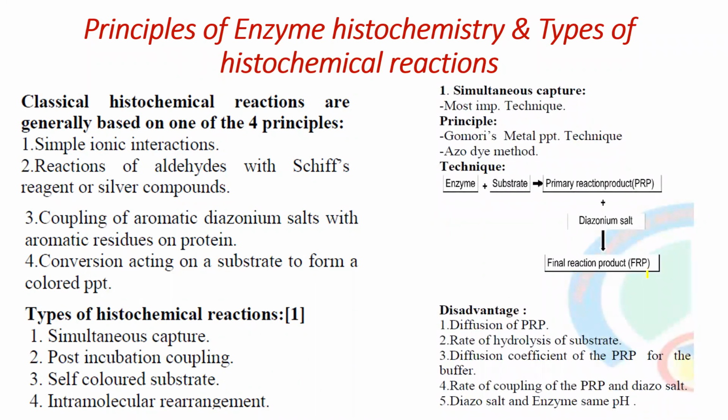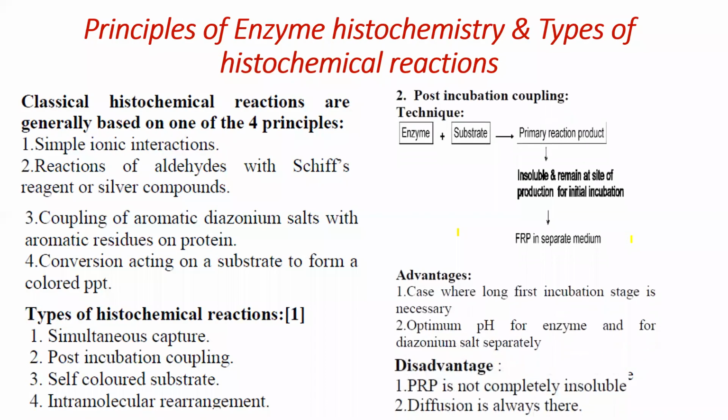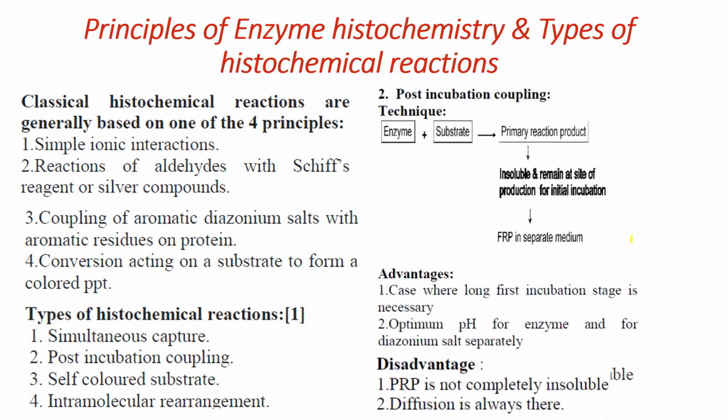Simultaneous capture, this one: here the diazonium salt played a crucial role. The second one is post incubation. We get a primary product that is insoluble, and this insoluble product is incubated to develop the color. So that is post incubation coupling.